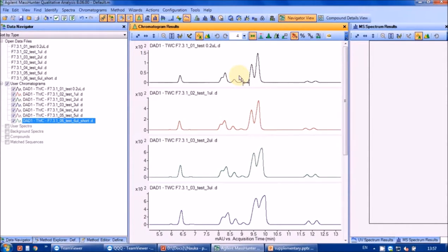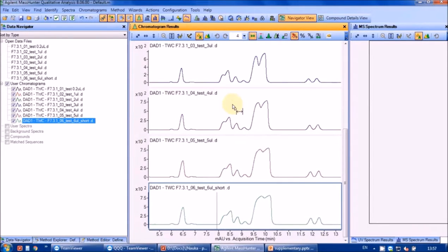is not practical. It is labor intensive, blocks the instrument for a long time, and generates large volumes of chemical waste. On the other hand, high injection volumes lead to column overload, resulting in poor peak shapes and poor separation of closely eluting peaks. Additionally, if the sample is dissolved in a strong solvent, in our case acetone, high volumes will result in partial premature elution, peak deformation, or even peak splitting and poor separation.